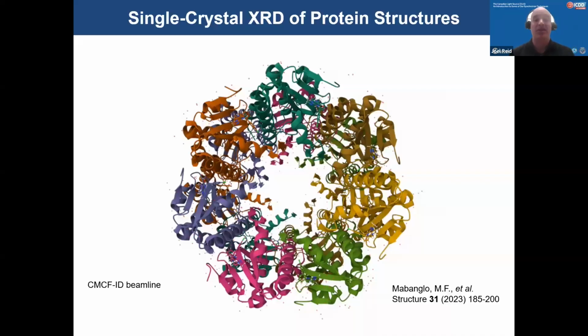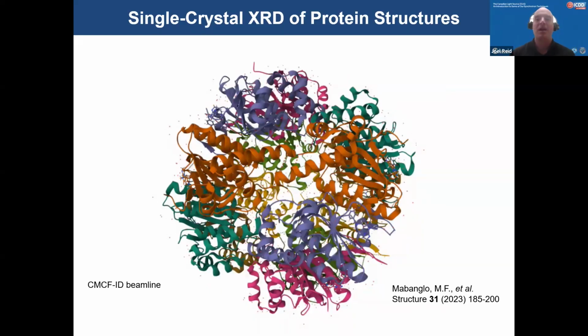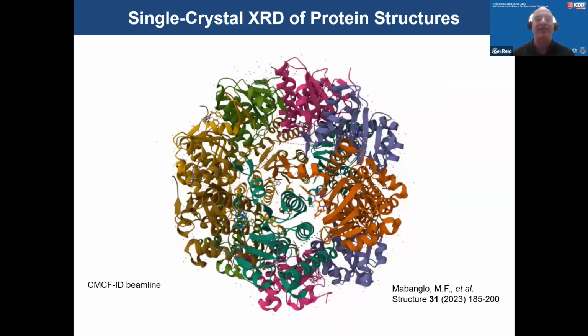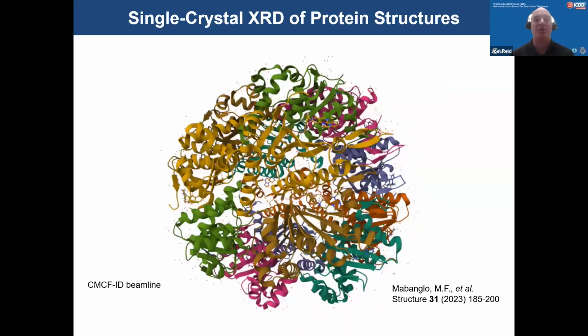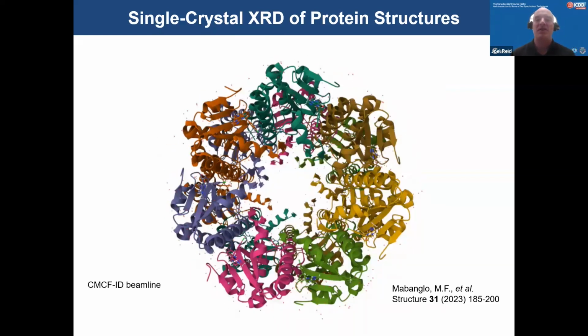We've seen what the data looks like. Here's a protein structure determined with synchrotron data. A single view of this protein molecule doesn't really do it justice, but rotating it gives you a better idea of the full 3D geometry. This molecule is a human protein complex from a study on the design of anti-cancer drugs. The entire molecule is made up of over 10,000 atoms, and solving a structure like this would be very difficult without the synchrotron.